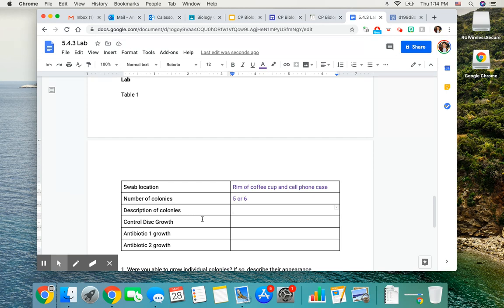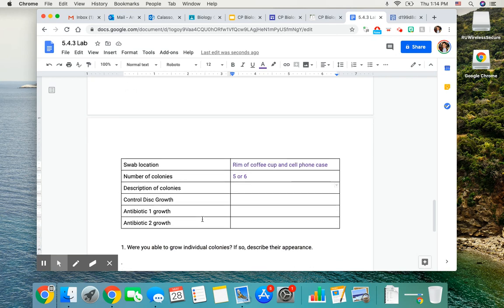They're being cultured for a certain amount of time at that temperature, half with the antibiotic and half by itself, and we're going to see the colonies. So in some, we might see that in antibiotics, the colonies actually increase or decrease compared to the other side without antibiotics. So that would be really interesting to see.